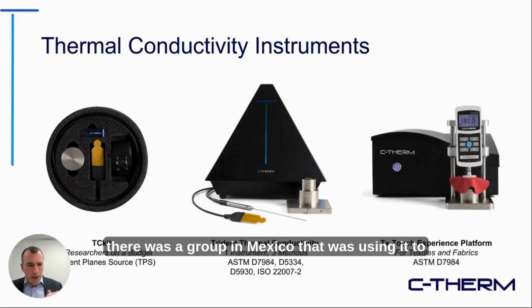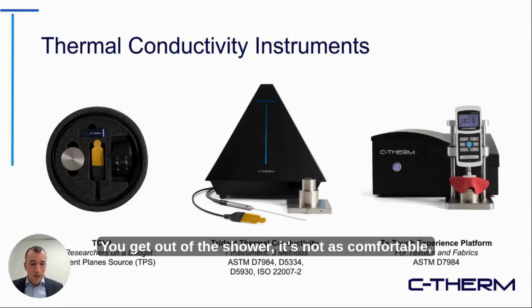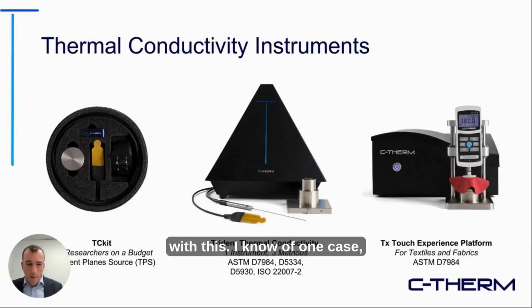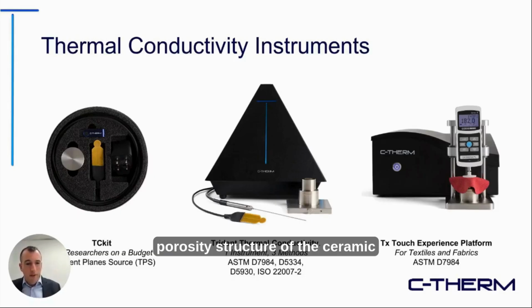For example, there was a group in Mexico that was using it to profile the feel of different ceramic floor tile. So when you walk on the floor, one of the challenges is as it gets cooler out, it feels cold. You get out of the shower, it's not as comfortable. Lower the effusivity of the material, so it has a warmer feel, and that's what we quantify, is that warm feel or cool touch with this. So I know of one case, a researcher in Mexico that was playing with the porosity structure of the ceramic tile and adjusting and tailoring the touch property in doing so.